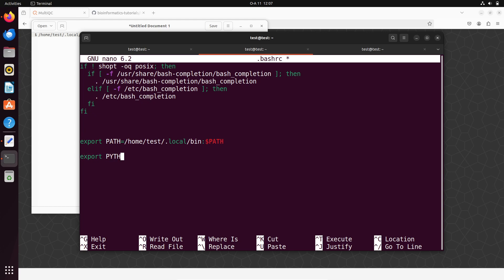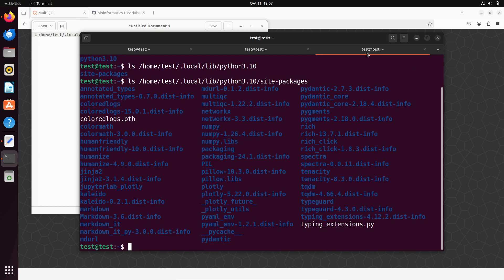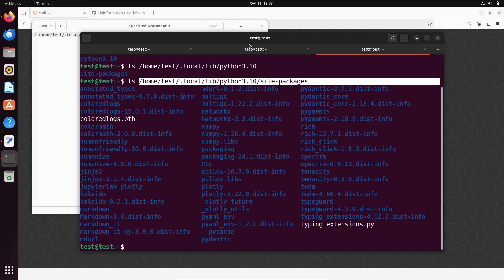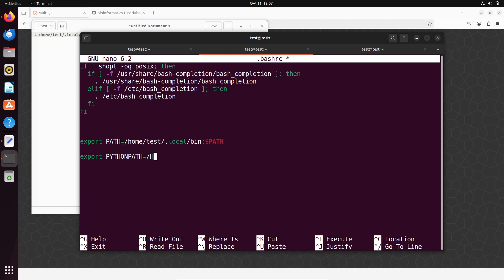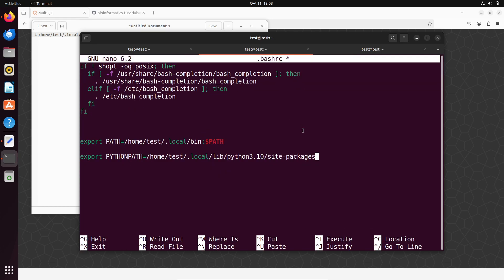Back in the '.bashrc' file, add: 'export PYTHONPATH=/home/test/.local/lib/python3.10/site-packages:$PYTHONPATH'. Make sure PYTHONPATH is all uppercase. This appends to any existing PYTHONPATH already set on your system. Once this is done, type Ctrl+X and hit Enter to save and exit nano.